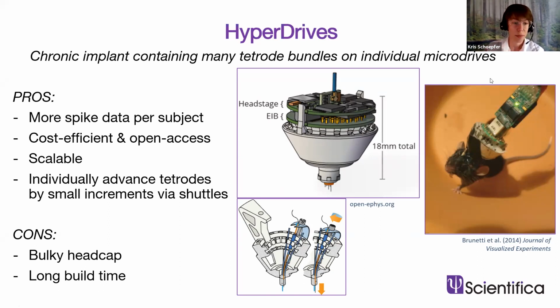The downside, of course, here being it is a rather bulky head cap. There's some risk of the head cap coming off. And like the tetrodes, this one even does have a bit of a longer build time. And I did mention these are scalable. The hyperdrives are also open access. You can 3D print them yourself.